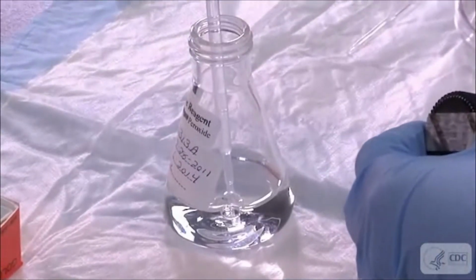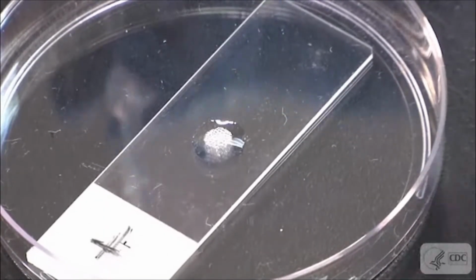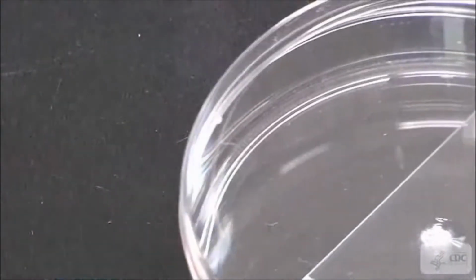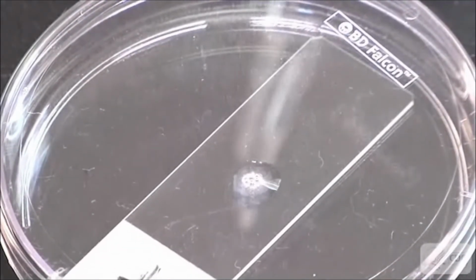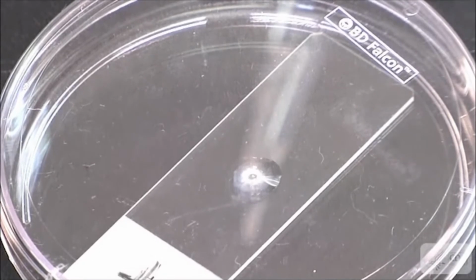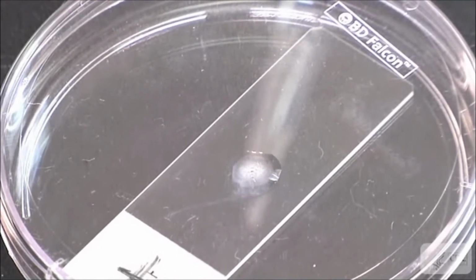Next, using a dropper, add 1 to 2 drops of hydrogen peroxide solution to the growth on the positive control slide and immediately place the cover on the Petri dish. Against your benchtop or a dark background, look for the formation of bubbles immediately upon the addition of the hydrogen peroxide. An immediate formation of bubbles indicates a positive reaction.